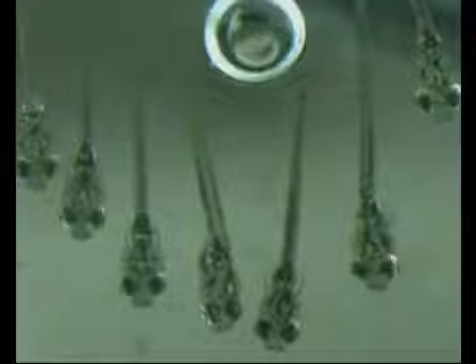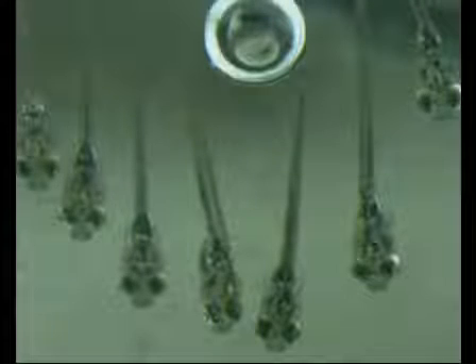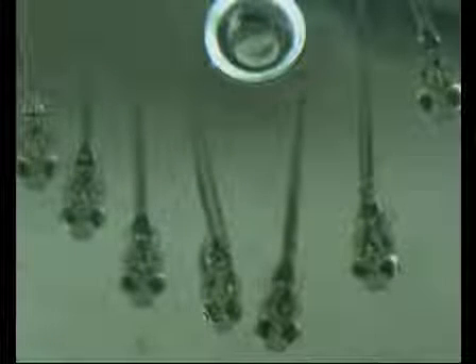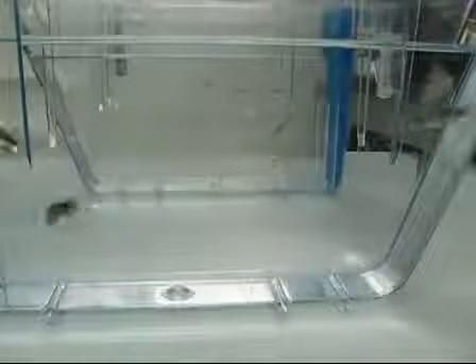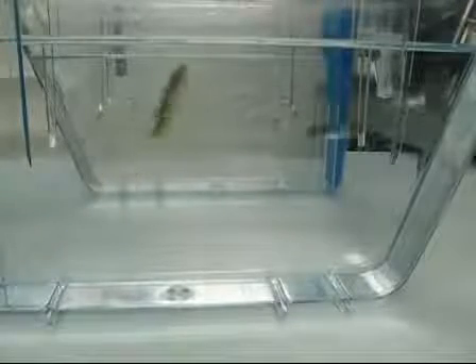In this video, we're going to show you a new protocol that makes it possible to record the adult OKR. And also, for comparison, we will demonstrate the OKR test for larval fish and the OMR test for adult fish.